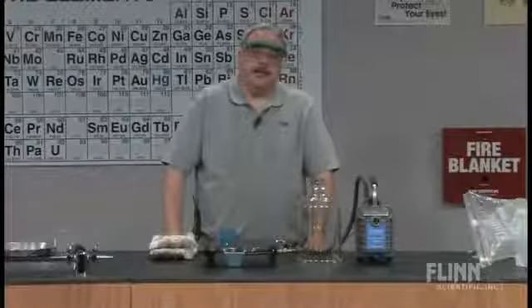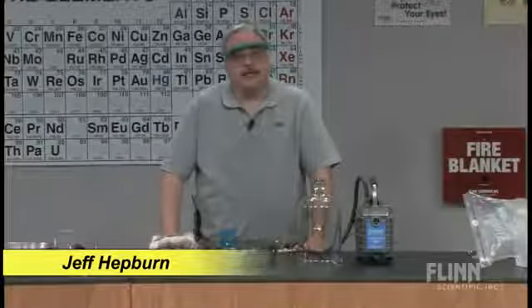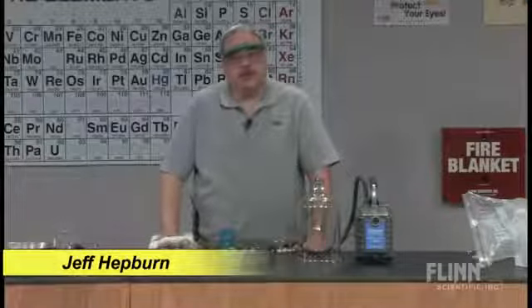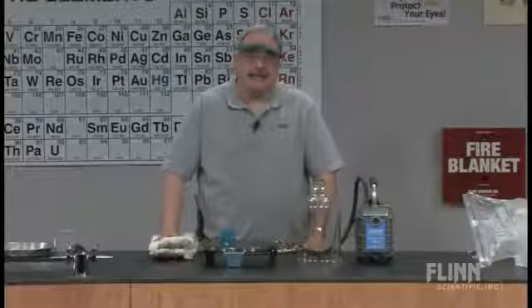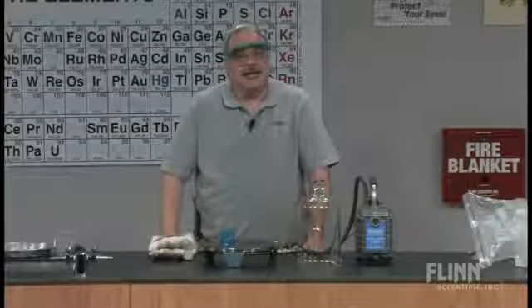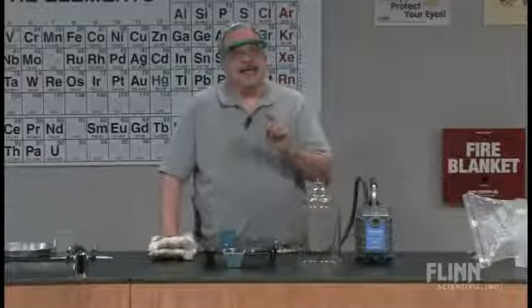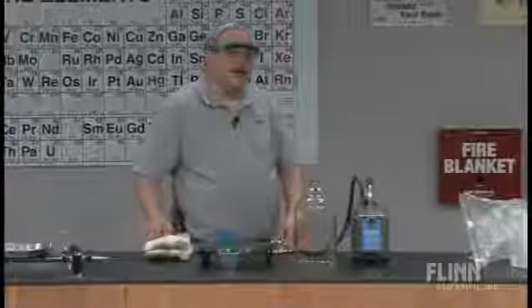You know, as you look in chemistry, there are many aspects of chemistry where it's important to study. And you look at the atmosphere, and one of the major components of atmosphere is nitrogen gas. Well, nitrogen gas can exist in many other states. And so we're going to look at some activities involving nitrogen gas in the liquid state. So what we're going to do is get some liquid nitrogen.